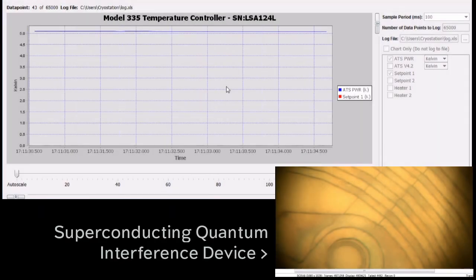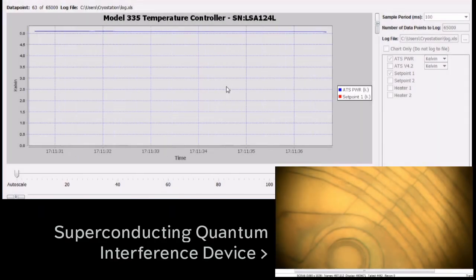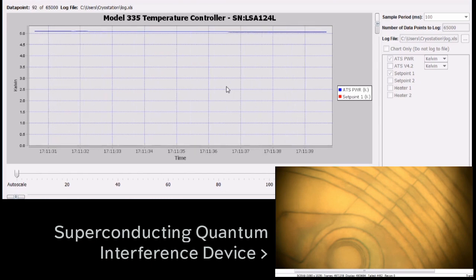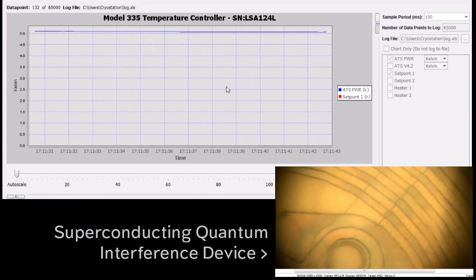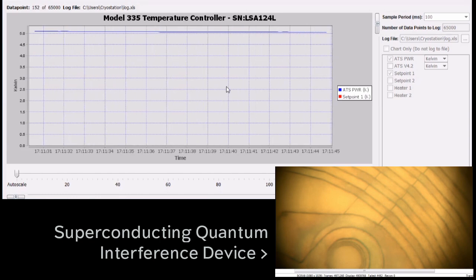What you see here is a white light image of a superconducting quantum interference device that is mounted on top of one of our Agile Temperature Stages. We're using our cryo-optic module, which Michael described earlier, to do this imaging.